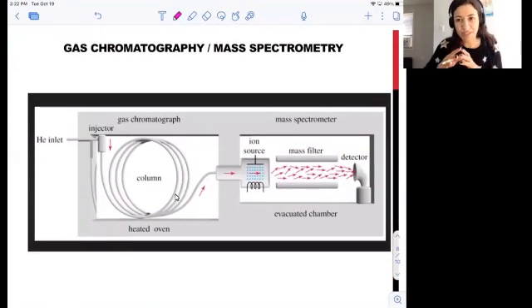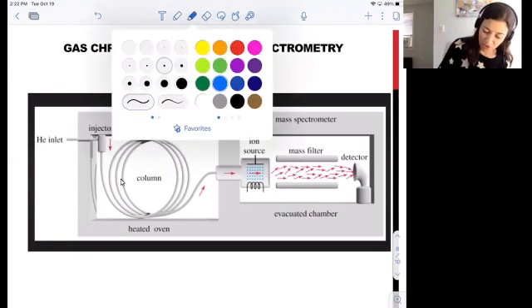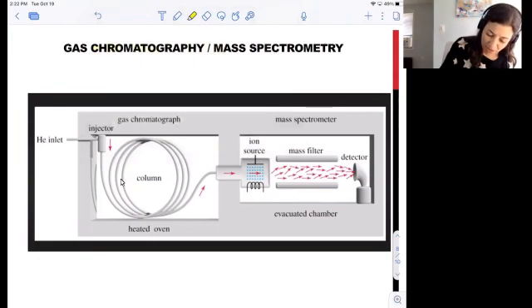In these last couple of slides of this week's video, we're going to take a closer look at gas chromatography mass spectrometry and look at a sample of what we can expect to see when we open up our data. So gas chromatography should remind you of something we have done in the lab before. During the second week of lab, we carried out column chromatography.